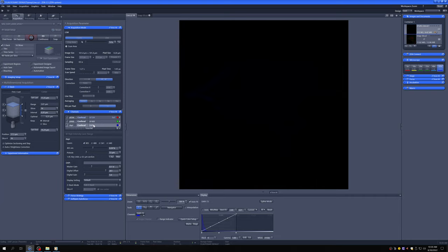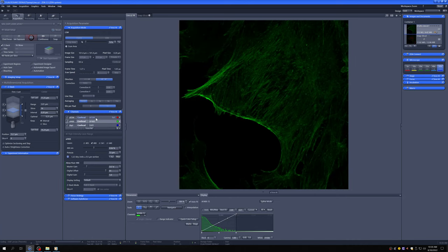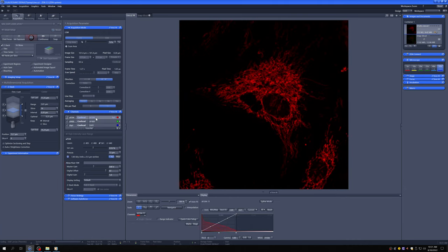for your different channels. So if you go down here, you can see, I can't see anything. If I go in the middle, I'm through the middle of the nucleus. The cells are there. This is there. So that's fine.